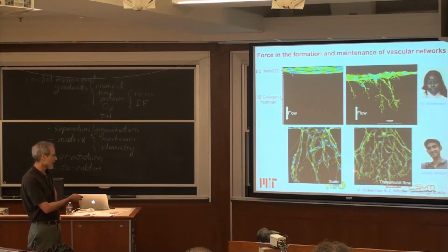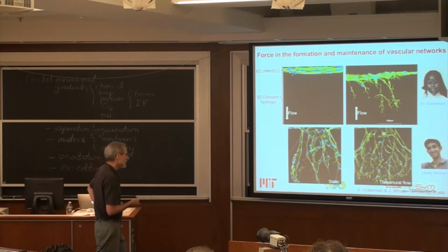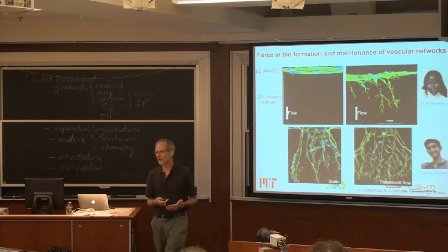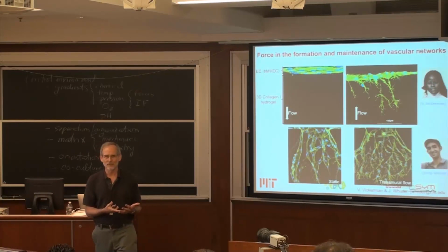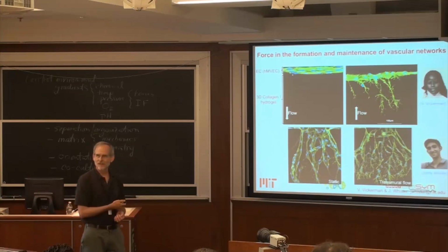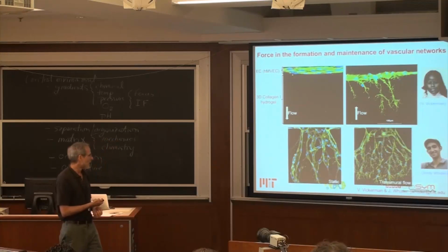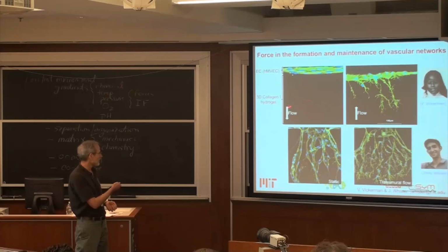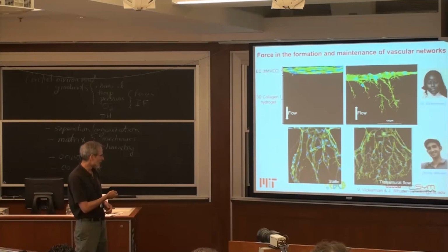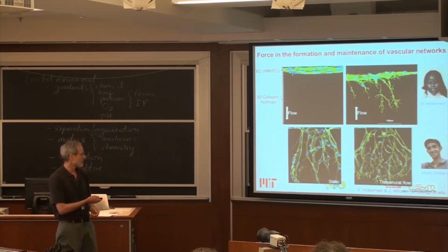But you can see the effect that it has on the formation or the morphology of the vascular network. We expected the transmural flow to be something that would occur in vivo and that would probably lead to a better developed, more stable vascular network. From the initial results, it looks like it has just the opposite effect. We've tried the flow both from this direction down, in other words like this, or from this direction up. But it seems so far as though the static configuration, one where we don't have any flow generated, seems to be optimal. But those are still experiments in progress.